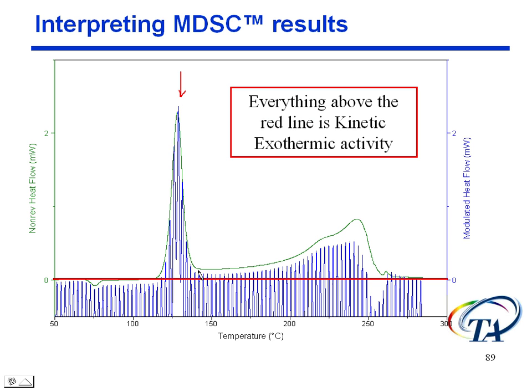But see, it never goes back down to 0. Right around this region, we're always seeing some exothermic activity. And that starts to build, and as we're getting up in this region, it gets even bigger, and then it drops down endothermic, and then we get back to a baseline. That's important to help interpret these results.